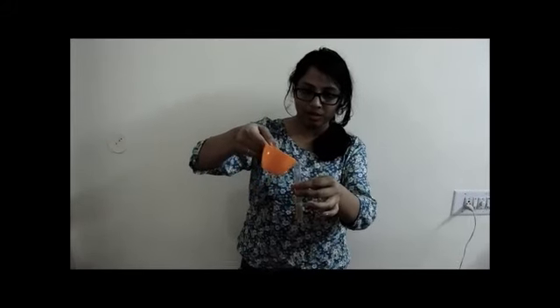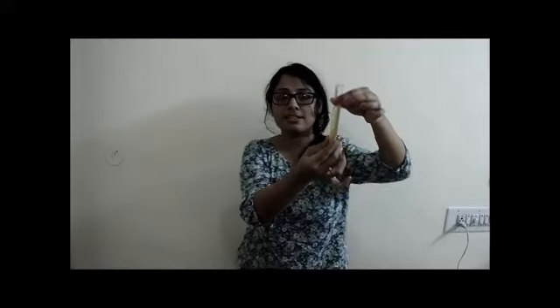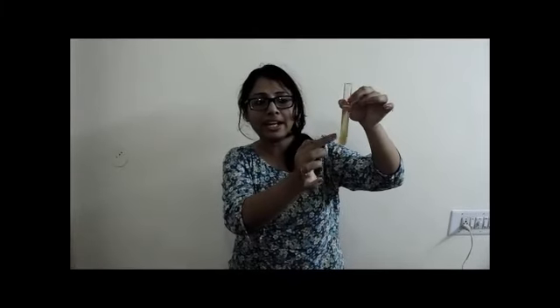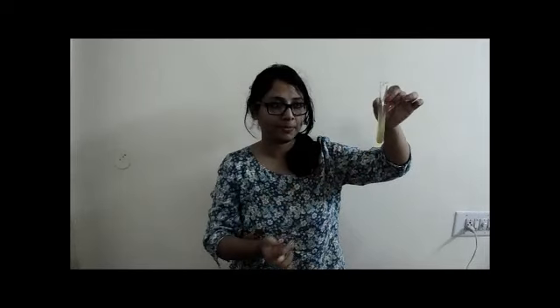Now pour the chilled rubbing alcohol. Can you see two distinct layers form? This is the alcohol and this is the tomato solution. DNA will be found in between these two layers, somewhere over here. And in this manner you can extract DNA from cherry tomatoes. It's simple and easy.